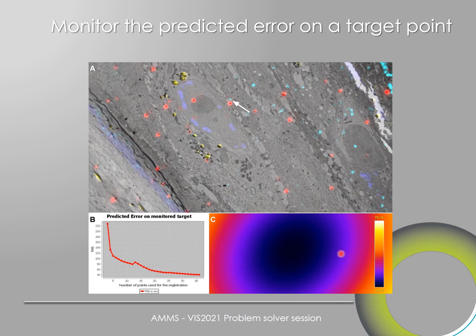Here, in that case, we can see that the map we've been doing of the entire area is also quite interesting. We have a precision of 38.49 nanometer in the center, while at the periphery it's still 75 nanometer, and the 75 nanometer is still more precise than the light microscopy we've been using, since those images were taken on an epifluorescence microscope on section, fluorescence microscopy.